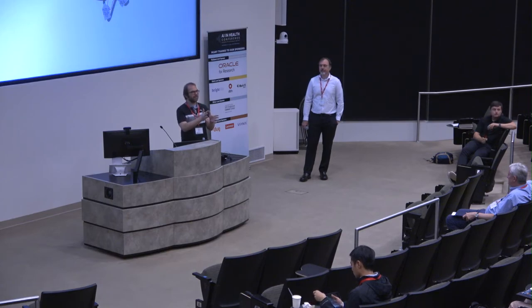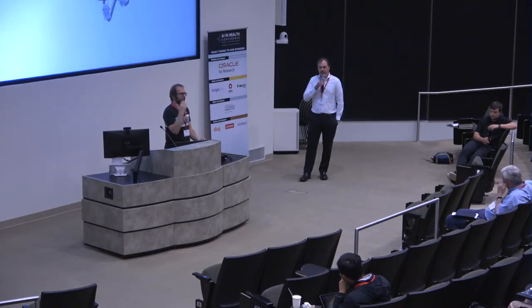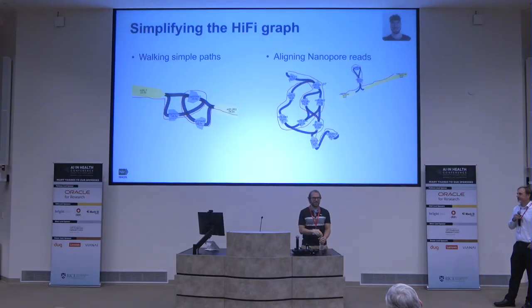Well, I mean, that's essentially what we're doing. We do the ONT reads walk it independently, all of them, and we see which way they walked. So that's the automated algorithm: it sends all the ONT data at the same time through the path independently, and then we see how well they support it, if there's a winner that they're all clearly voting for. Yeah. Okay. Great. This is why the manual analysis failed, because it's hard to make sure you get everything. Like I said, humans aren't very good at doing those kind of repetitive tasks, right?